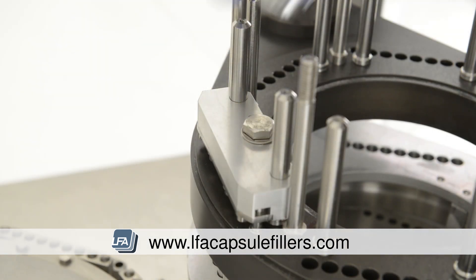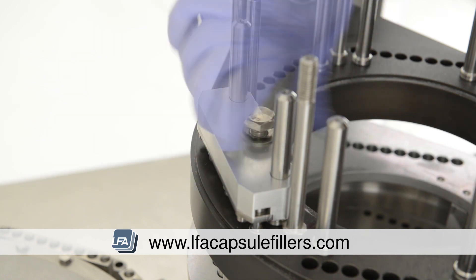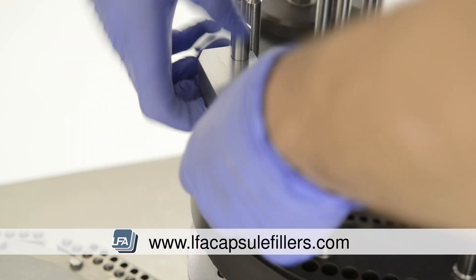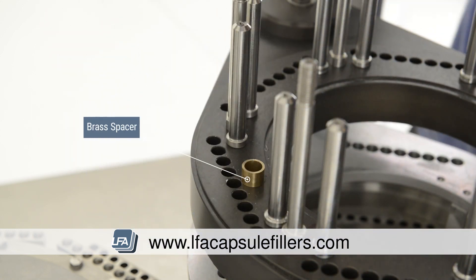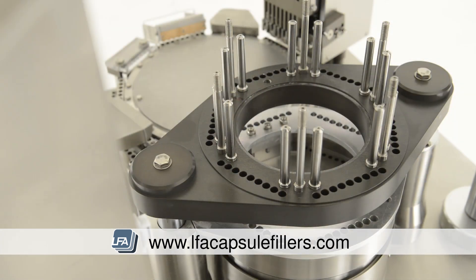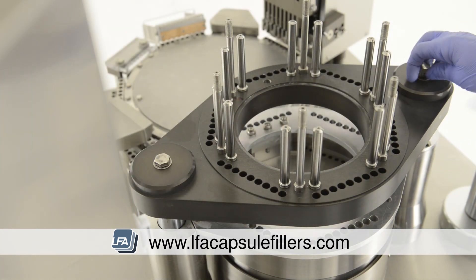Next, on the top section there is a 19mm bolt — take a spanner and remove it. Lift the block up and out. Be very careful with the brass spacer as it is extremely important and set to an exact tolerance. Remove the two bolts at either side and you'll then be able to remove the whole middle section of the tamping turret.